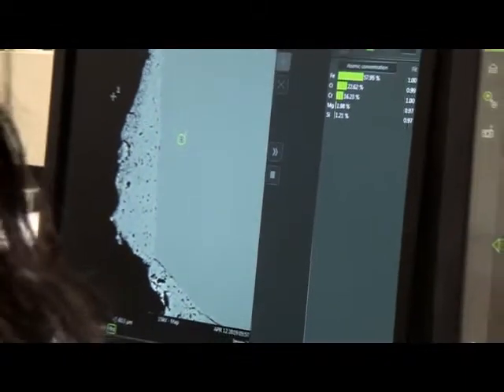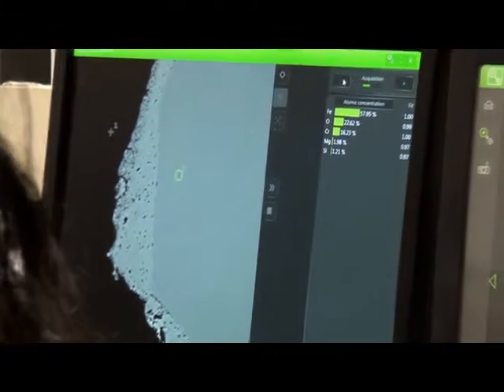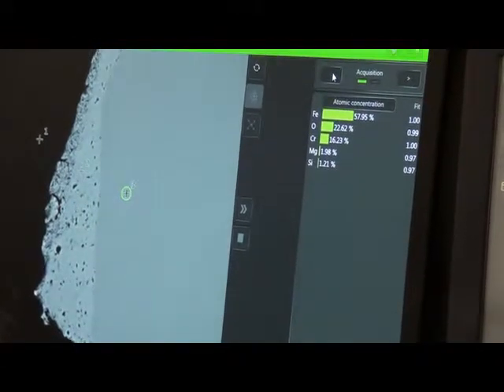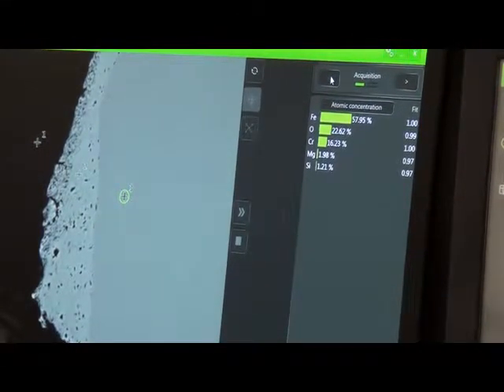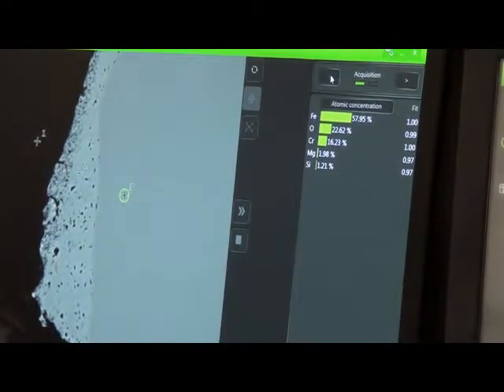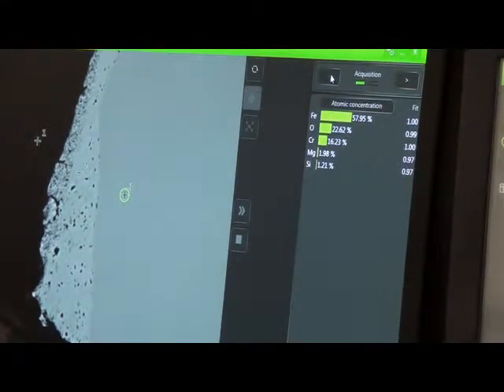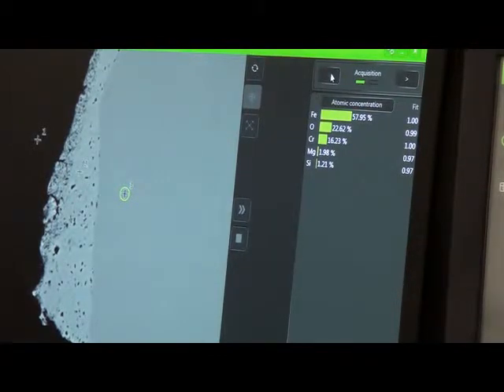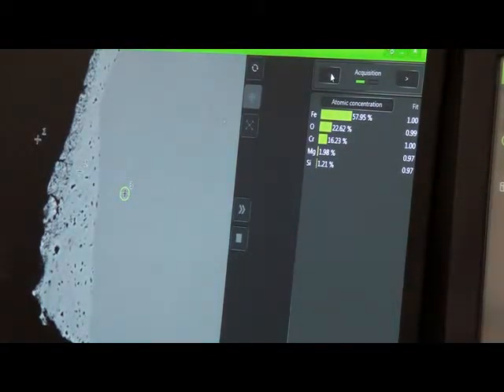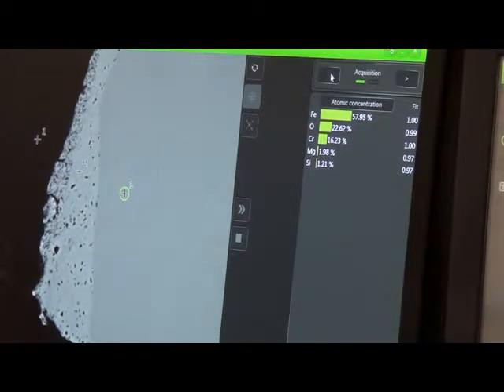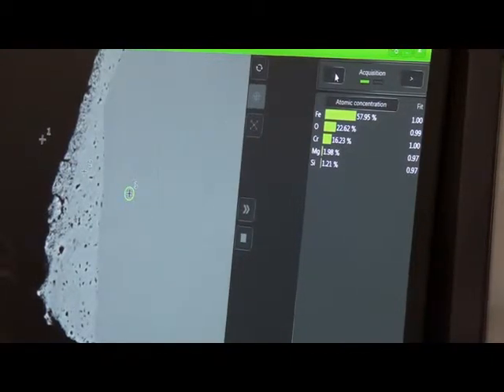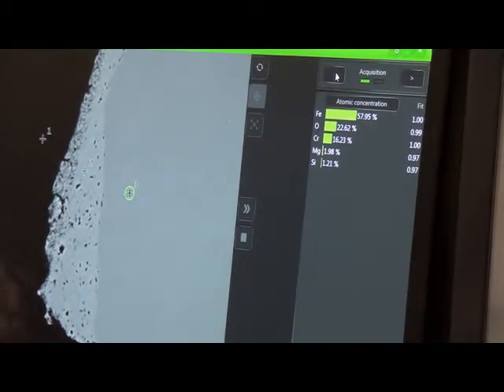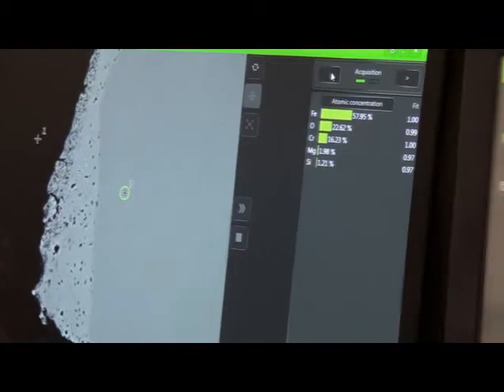And so when you're doing your studies of chemistry, especially if you're looking for things in small amounts, you're going to want to set the machine to have the highest current. And you're also going to want to, we can change this to count longer. But again, what we wanted to see here today is an example of a solid state chemical reaction that you can see in a rock which is actually local to us. So thank you for your help.